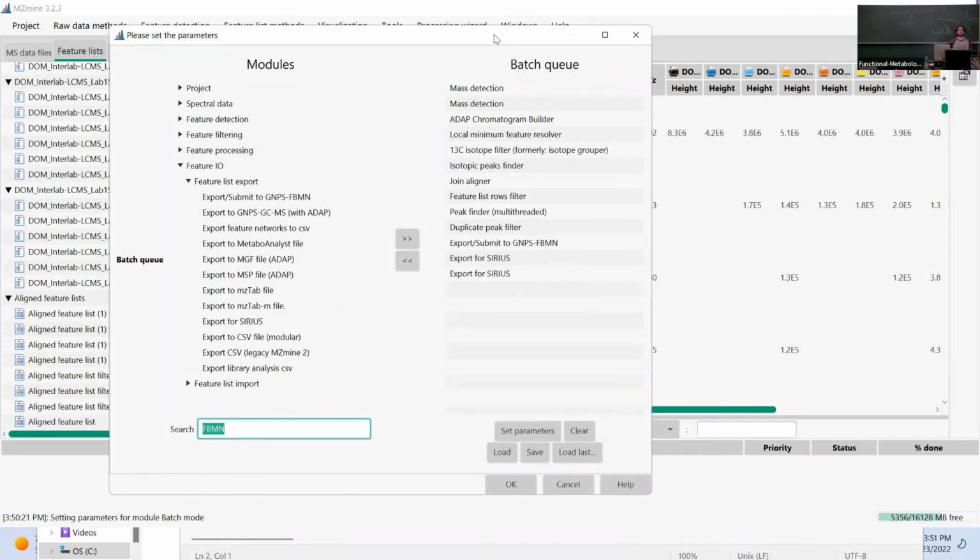Crashing a lot. So the batch queue, how to incorporate some of the data, try to process some data, and then just do the feature alignment and everything on all data at the end. So yeah, some people might have some problems with the steps, because it was very fast, right? And there's so many parameters to set up, so maybe you also got some parameters wrong, and then you get way too many features, and it's way too big of a problem.